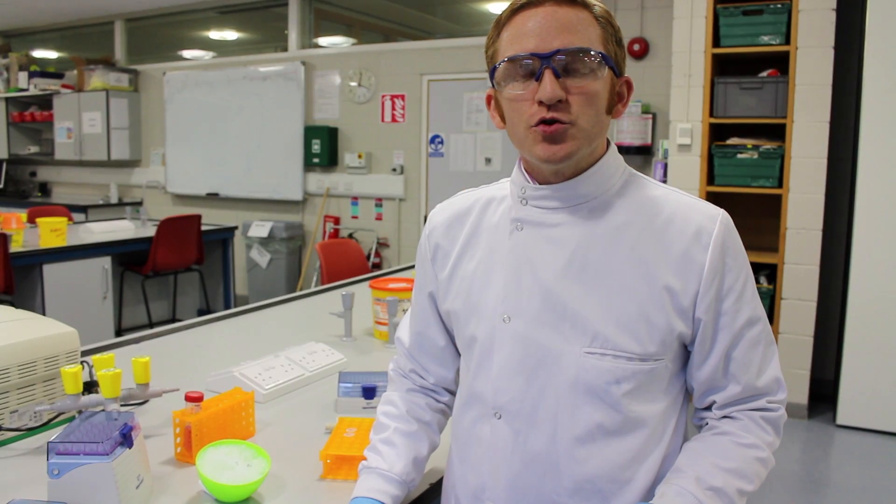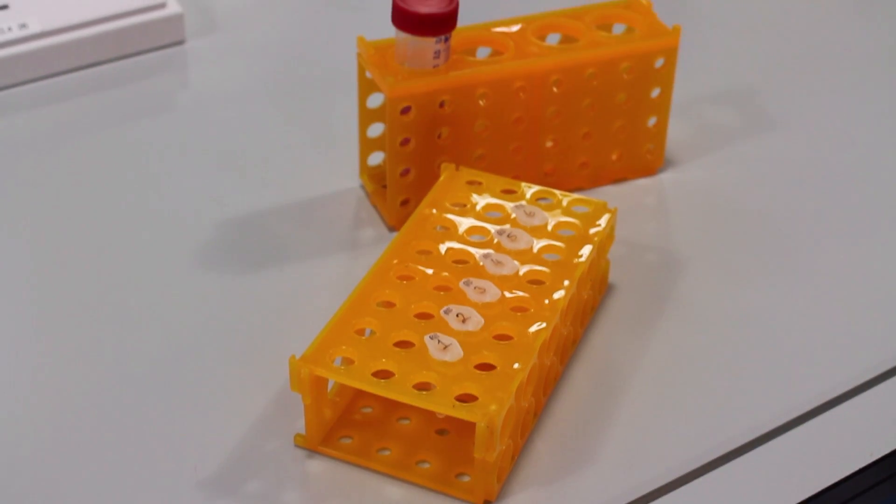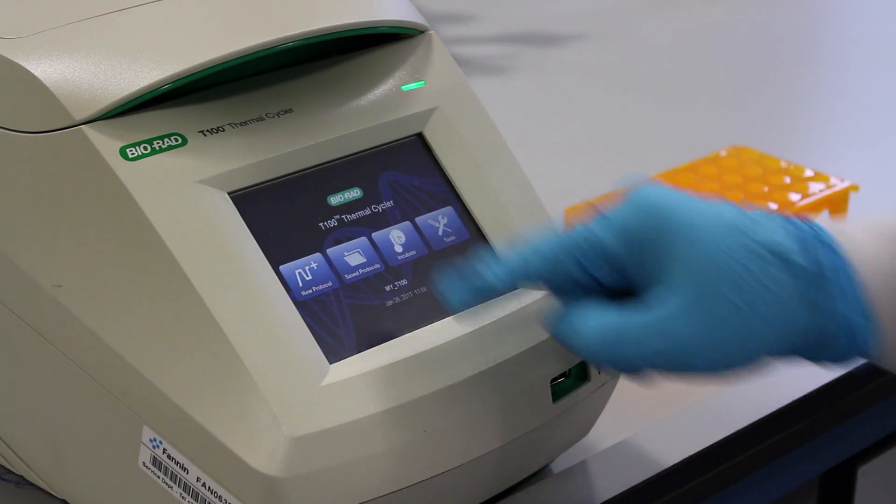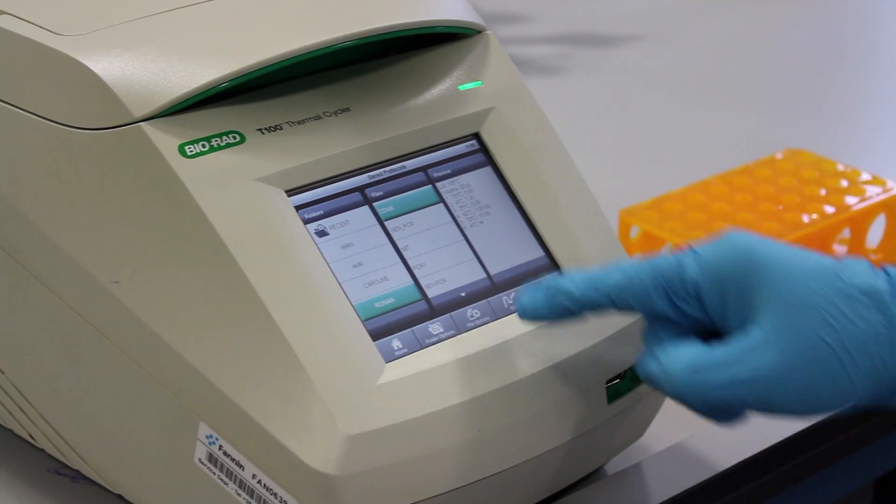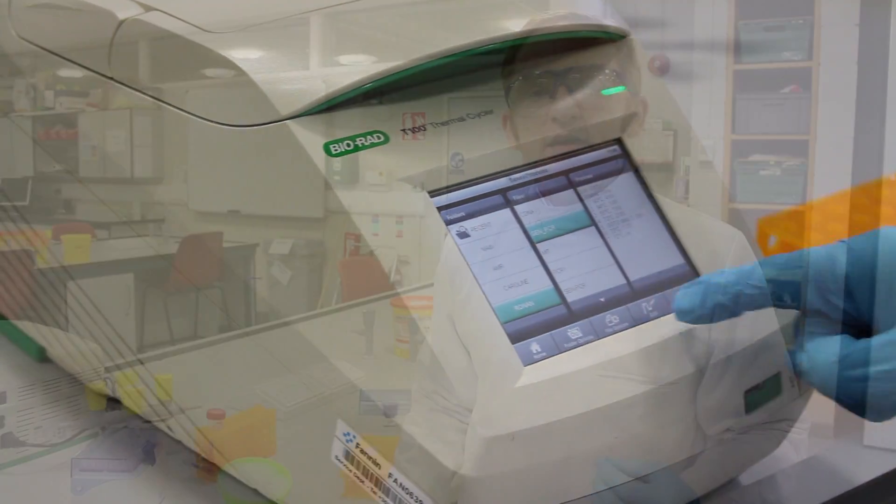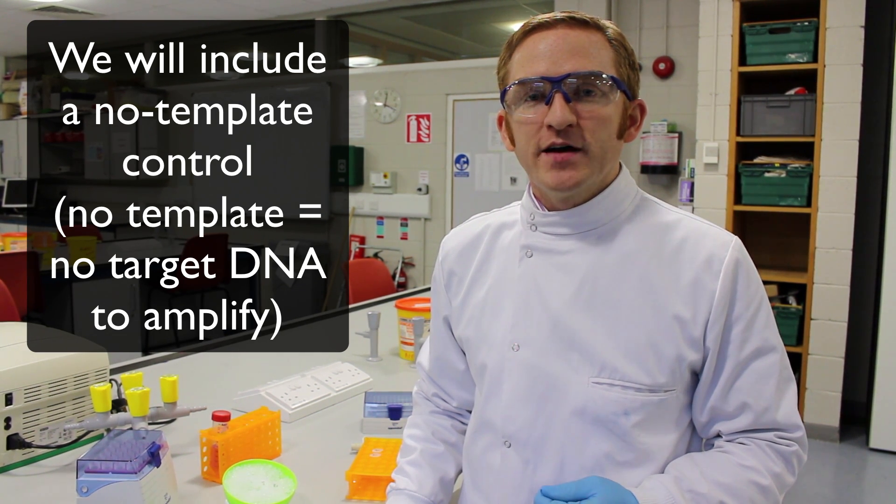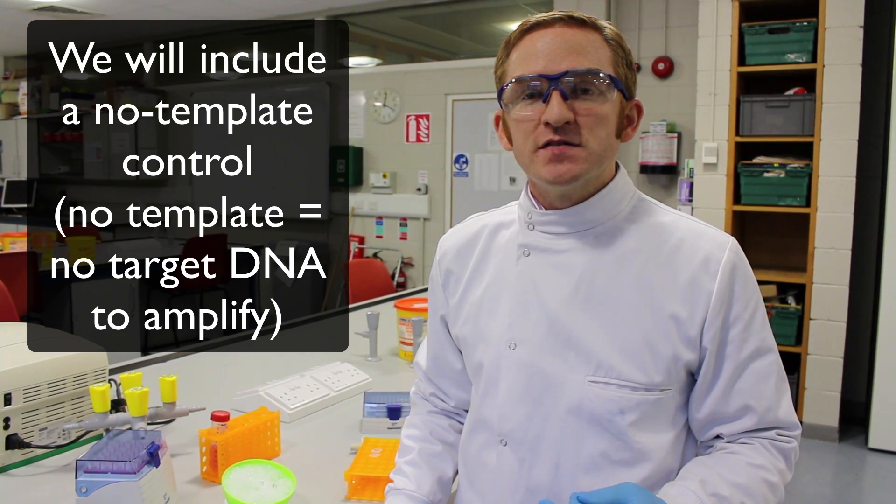A big threat for any researcher performing a PCR reaction is contamination. It can ruin your experiment completely and even give you false results. So it's essential to build in controls. You'll have seen in the manual, and you'll also see in the lab itself, we'll be performing a negative control. It's vital that this is performed for every single PCR reaction to ensure there's no contamination of any of the reagents.